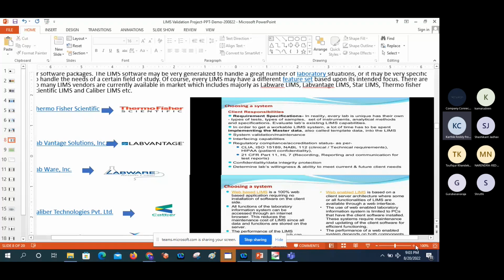Why? Because as per the CSV life cycle, the entire qualification was done. So once you are giving the system to the end user, the master data plays a very important role. Why? Because whatever we have, like specifications and STPs, all the data we need to prepare in a specific environment, which is a static or development environment. Those can be migrated into validation as well as production.